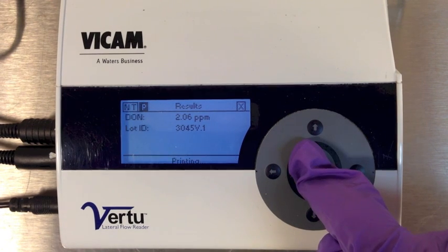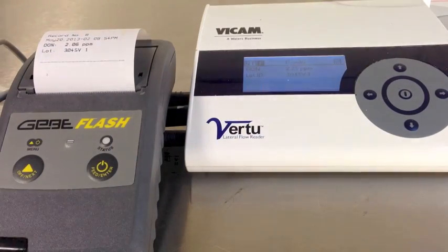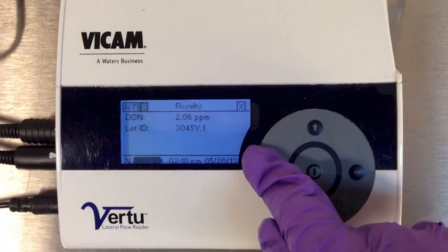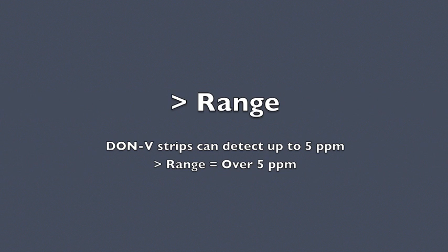To print the result, use the right arrow key to select P in the upper left corner of the display, then press the Center Enter button to print. To run the next sample, use the arrow keys to select NT for next test, then press the Center Enter button to select.